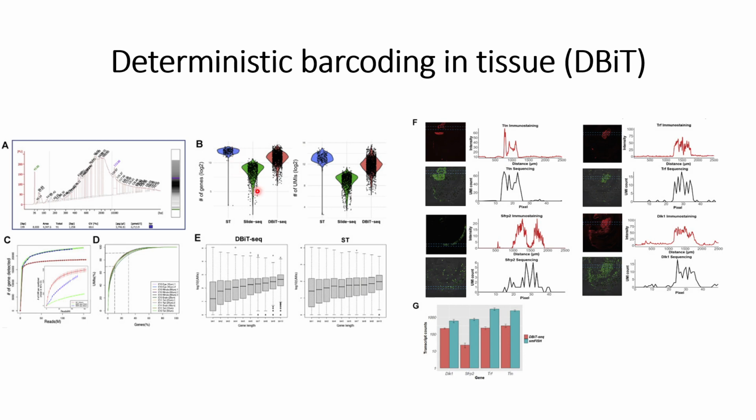And this is about the number of genes and unique molecular identifiers, and they also looked at how the number of genes detected in different techniques compares to the number of reads being identified. In this case they found that the 50 micrometer microchannel width and the 10 micrometer width are almost similarly saturated at the same time. However, they are higher than the spatial transcriptome techniques.